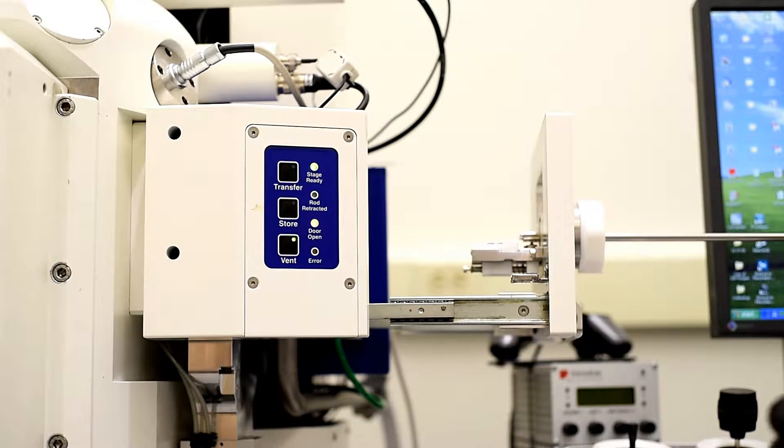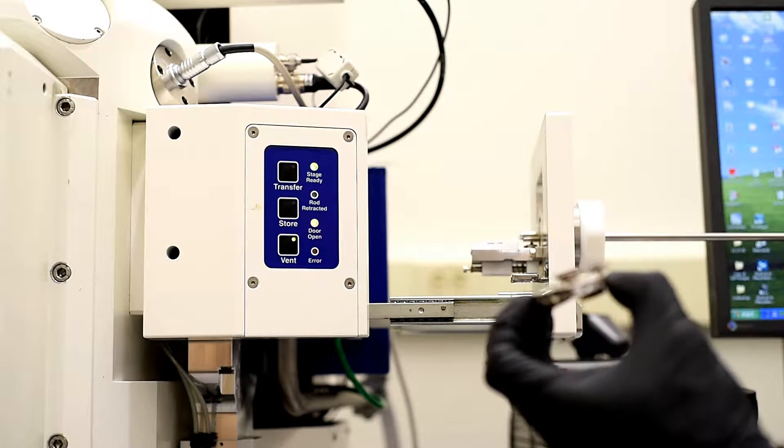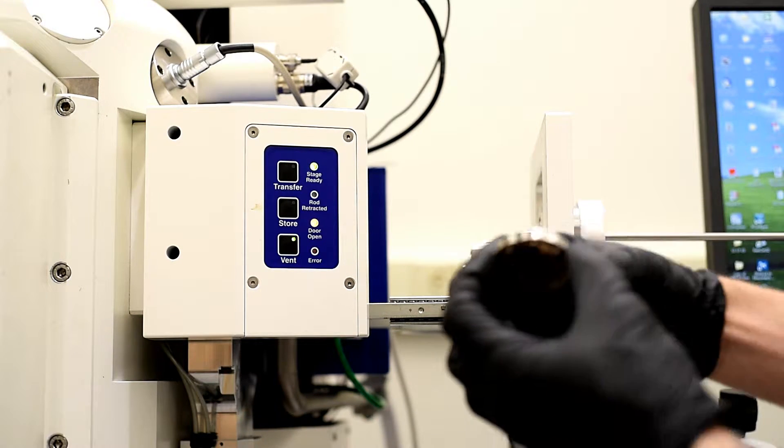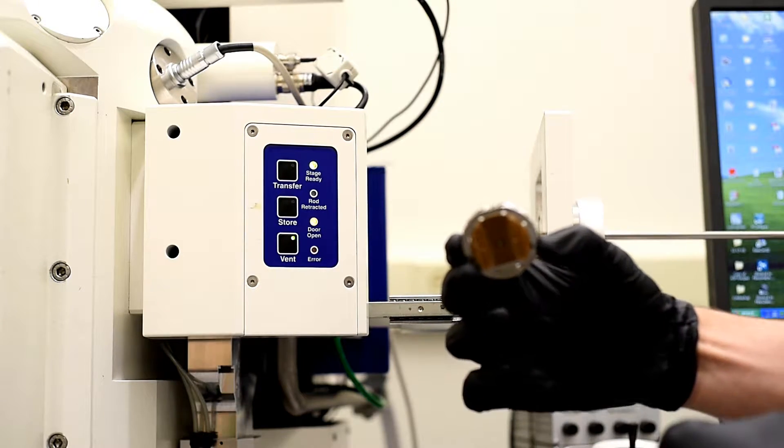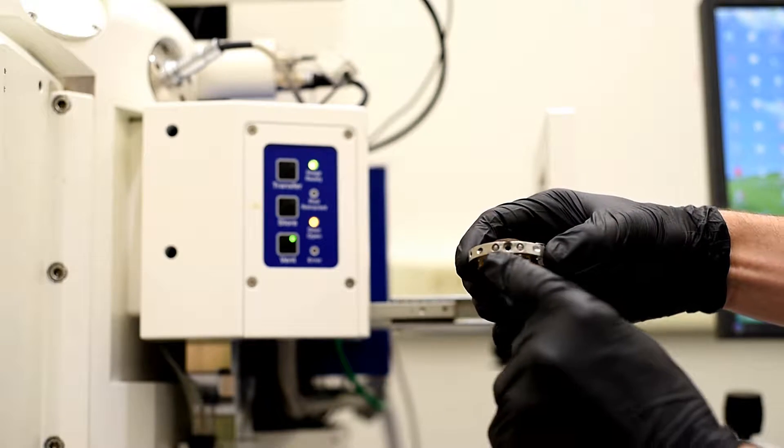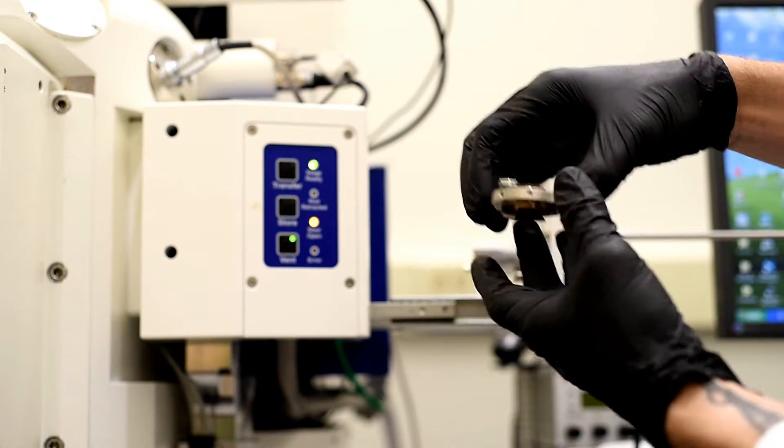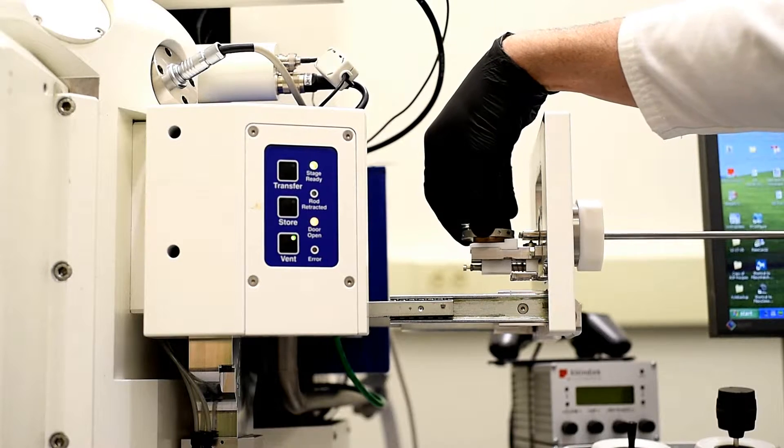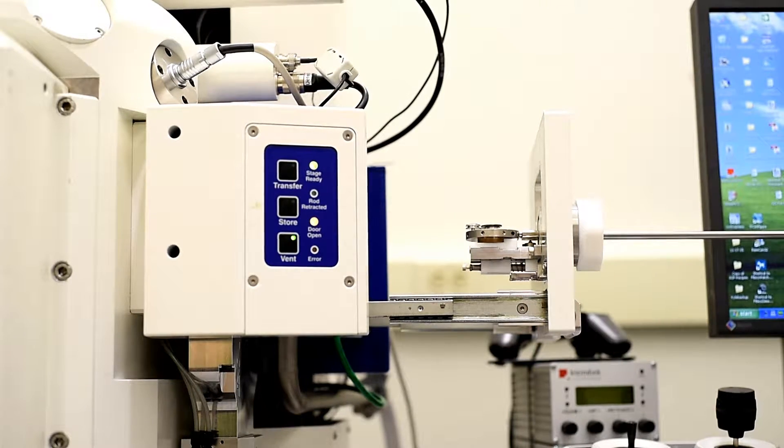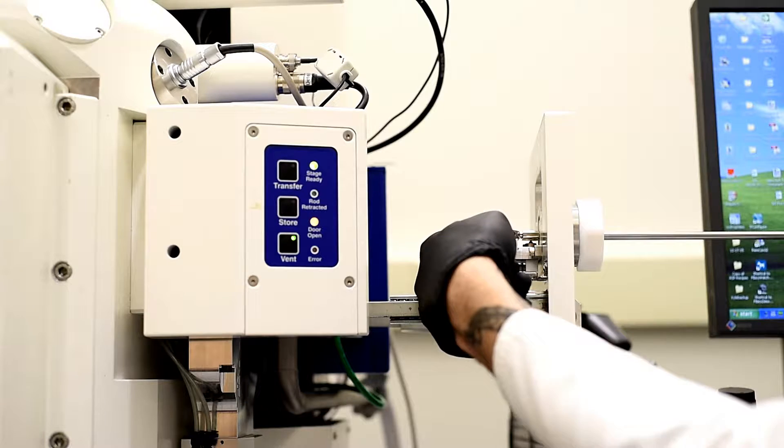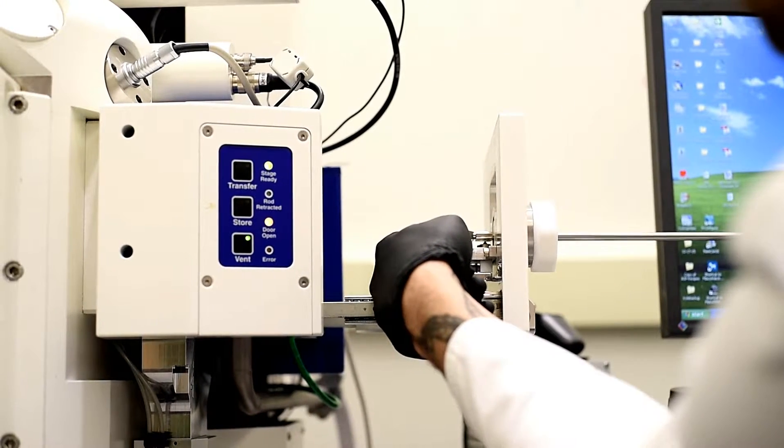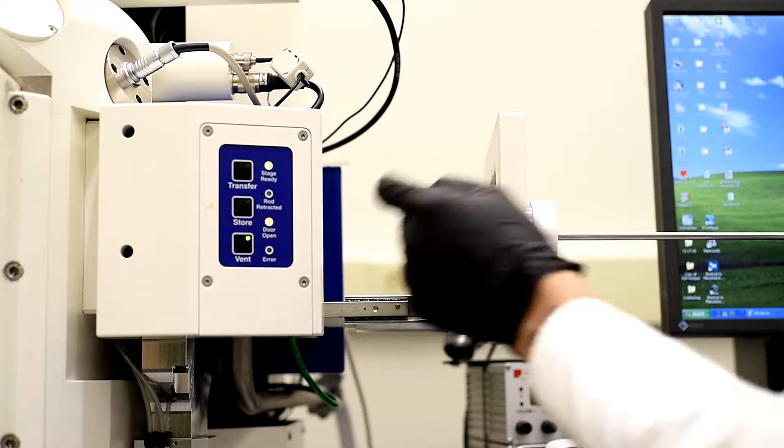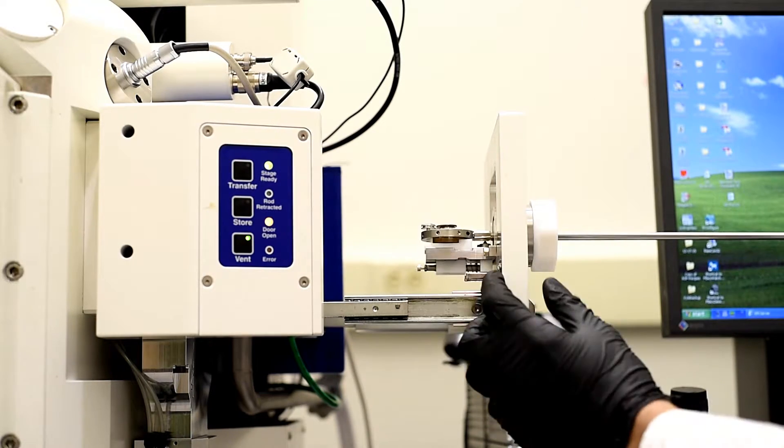And now we will load the sample holder onto the corresponding dovetail. So you can probably see that there is a dovetail formation on the bottom of this. And you will slide the side with the screw holes this way. So it will slide over the dovetail, the Teflon dovetail. And then I like to hold the back of that while I use this arm to screw in the arm to the sample holder.